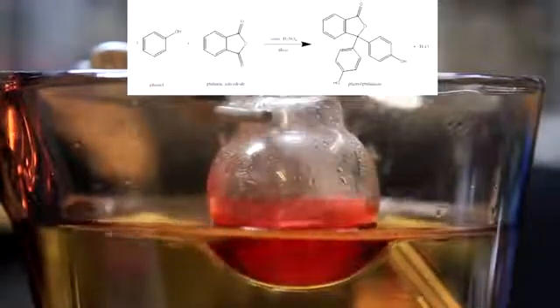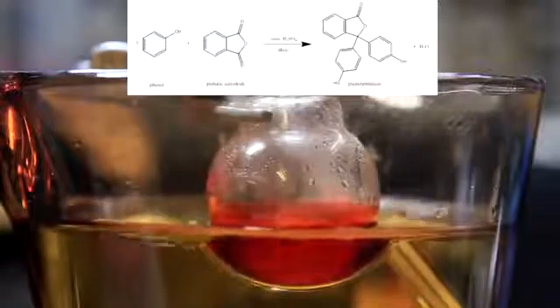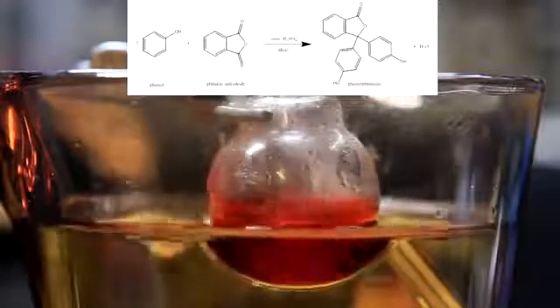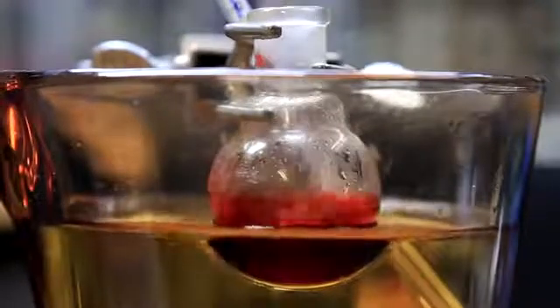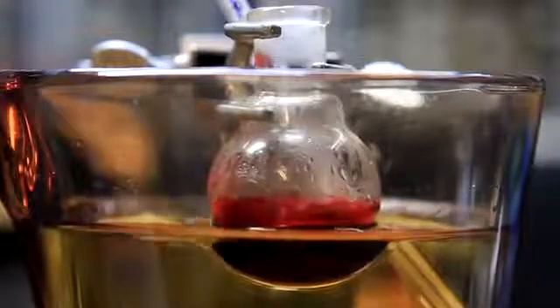Because this takes place at above 100 degrees Celsius, the reaction is pushed forward by boiling the water away. As the reaction proceeds, it goes from a cloudy red to a clear red and then finally it turns nearly black.